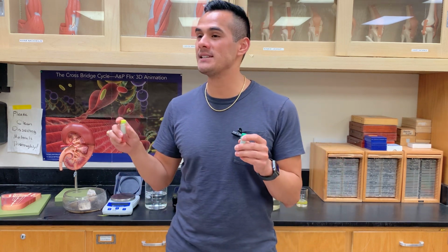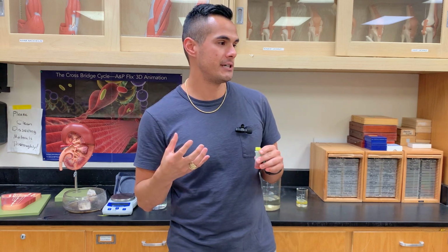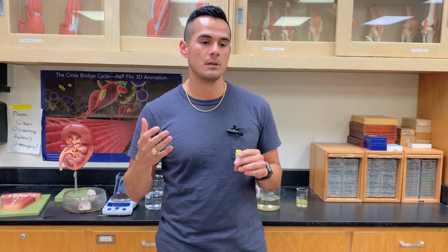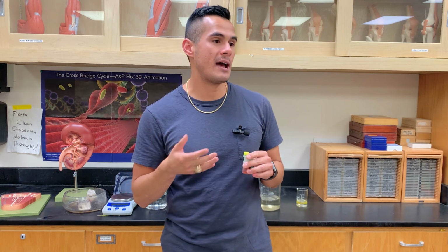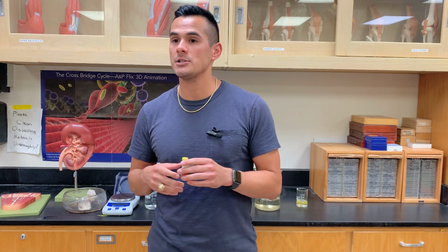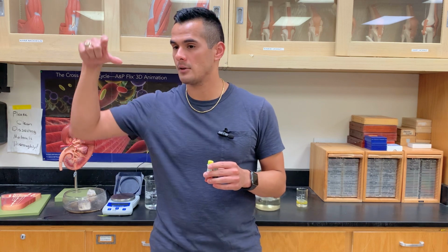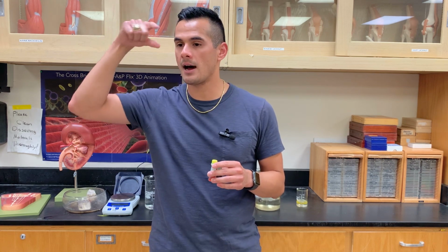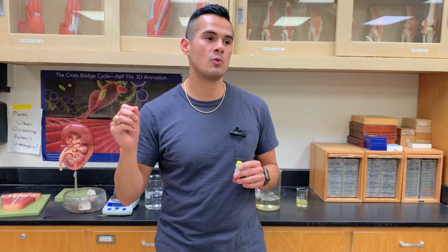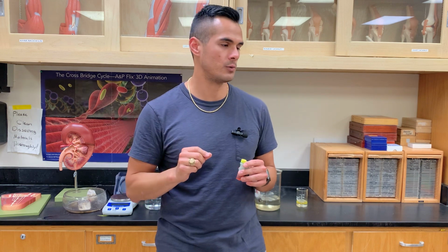The reason that we're doing this is to understand kinetic energy and how this can increase the rate that we reach equilibrium. So let's talk about a prediction. When we add one drop into the hot, one drop into the cold, my question for you is, which one is going to diffuse at a faster rate, the hot one or the cold one?